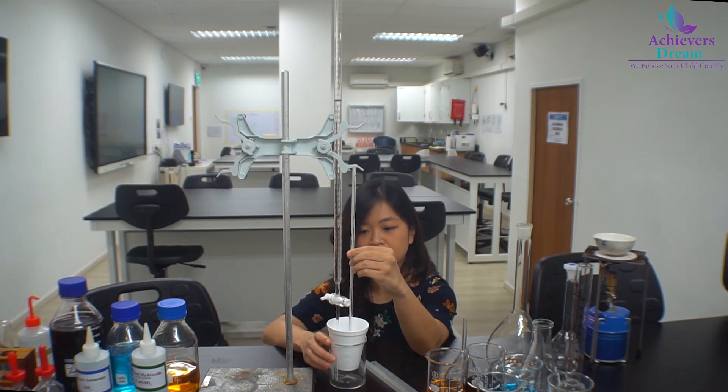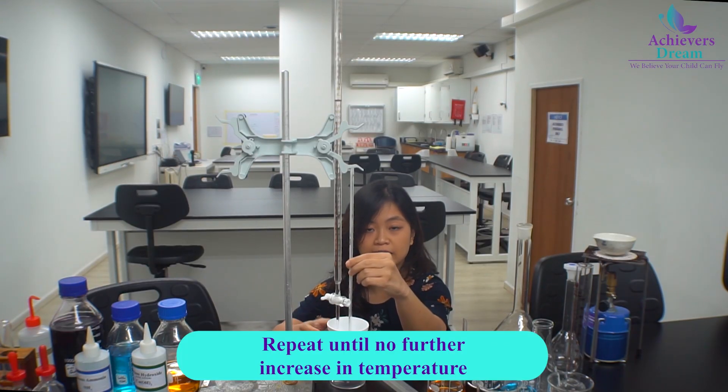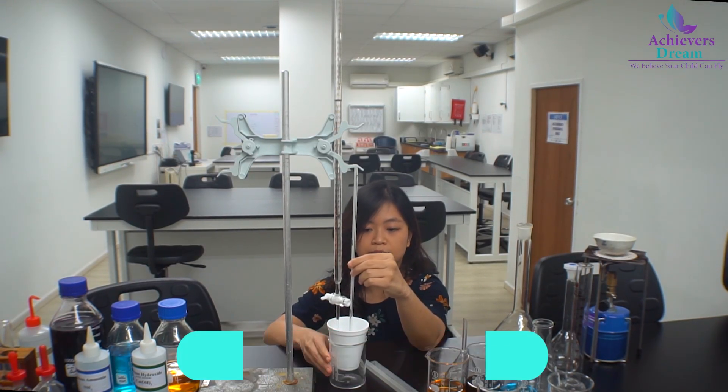We will repeat this procedure until a constant temperature is reached, meaning the reaction has actually stopped and there is no further increase in temperature.